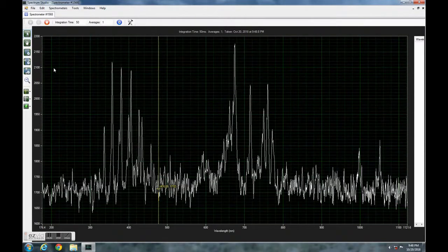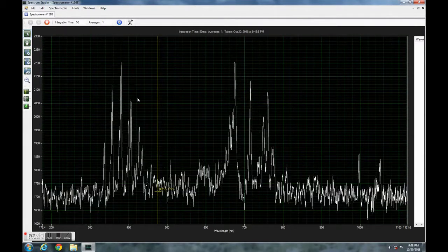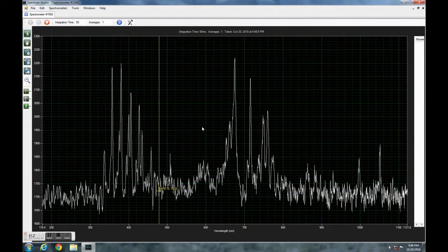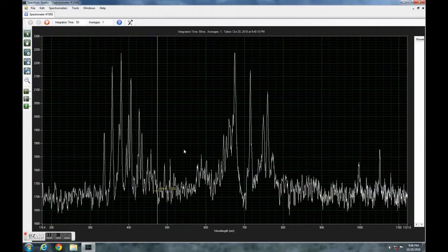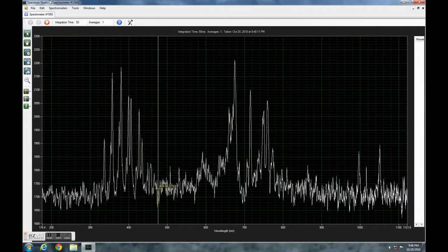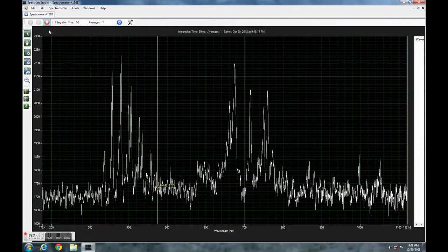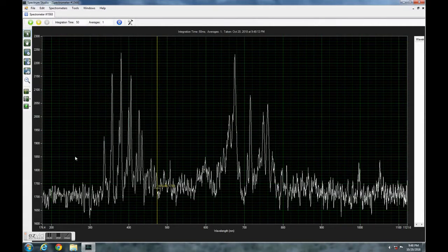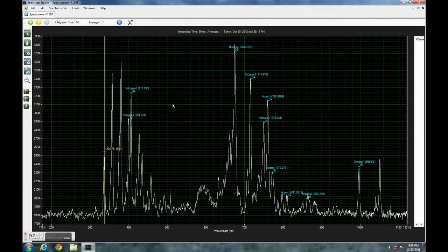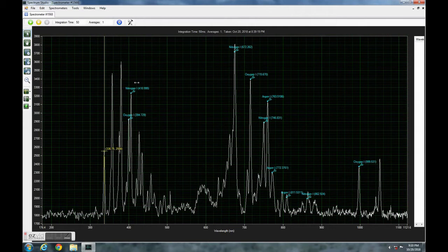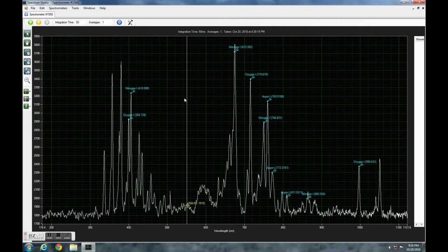The spectrum can get fairly complicated, so it's sometimes difficult to really identify any particular element. Since we start from air, we have mostly nitrogen and oxygen being ionized. And here we have those peaks being called out by the software. So I thought, hey, why not give it a try with different substances?